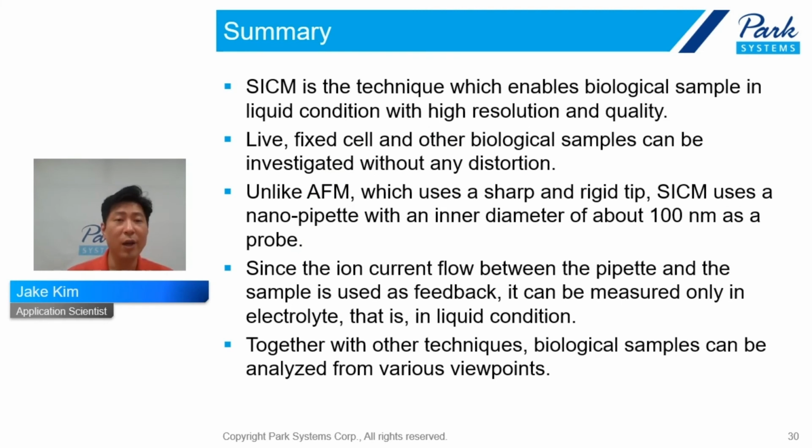Okay, this one is the last slide of today's presentation. To summarize today's talk, SICM is a technique which enables imaging of biological samples in liquid condition with high resolution and high quality. Live cells, fixed cells, and other biological samples can be investigated without any distortion.